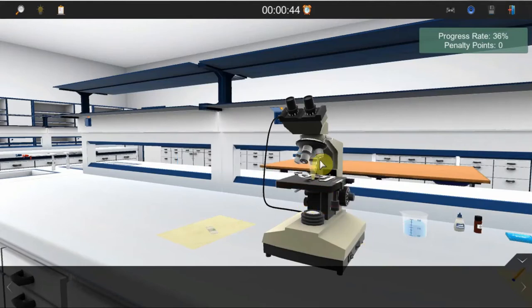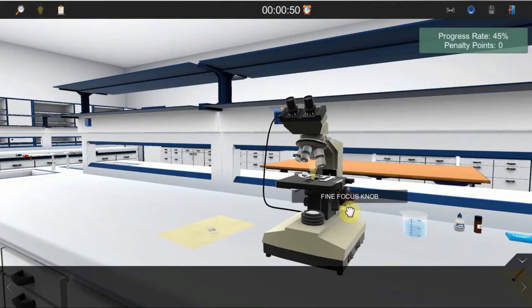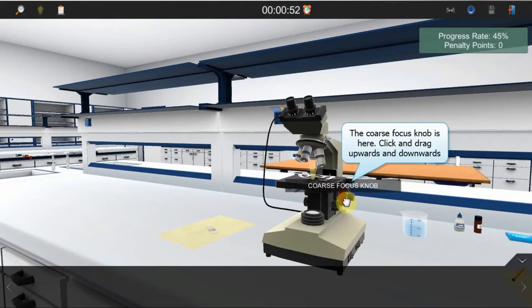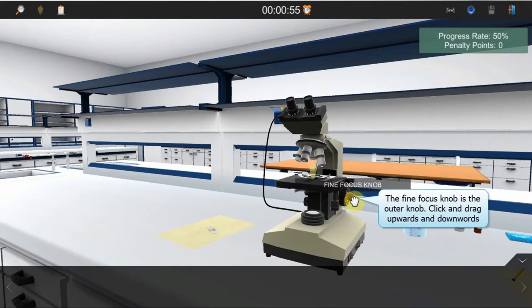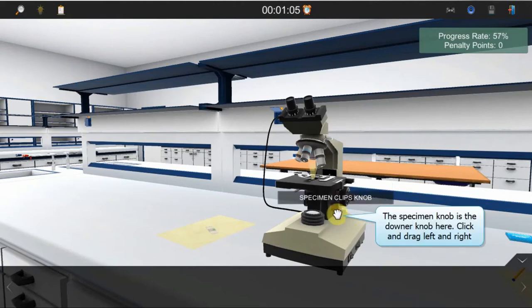Rotate the revolving nosepiece to the right to set the 4x objective lens into position. Test the coarse focus and the fine focus knobs by rotating them in both up and down directions. Test the stage and specimen knobs by rotating them in both left and right directions.